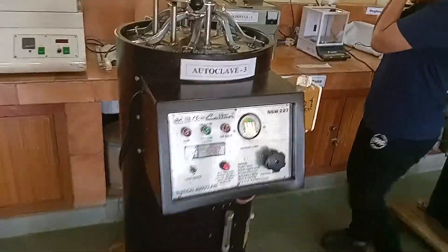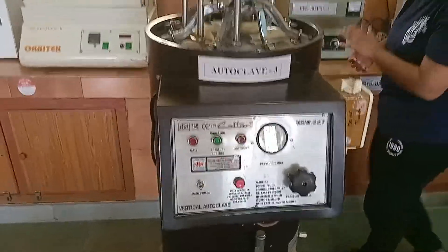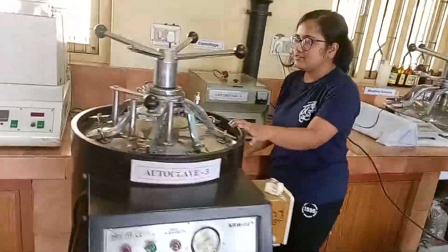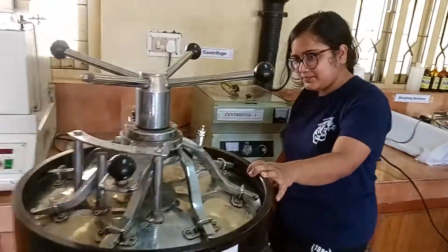Hey guys, today I'm going to show you the autoclave, how it works. I hope you all know how important it is in this biochem lab or in every lab. Today it is used — now let's see how it functions.